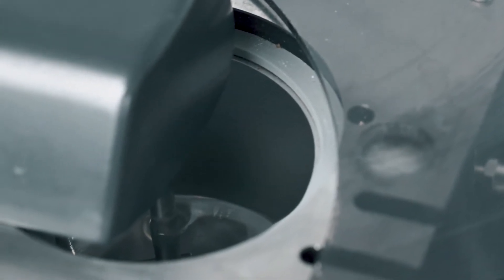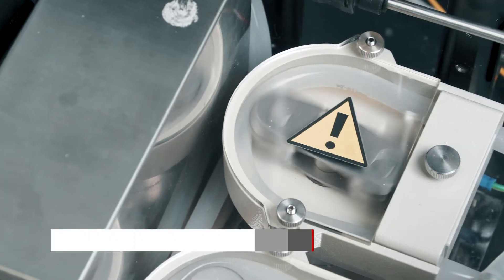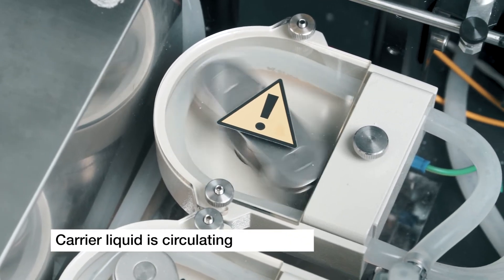Wet measurements are done in a carrier liquid which moves in a closed loop containing the sample tank and the measurement cell.